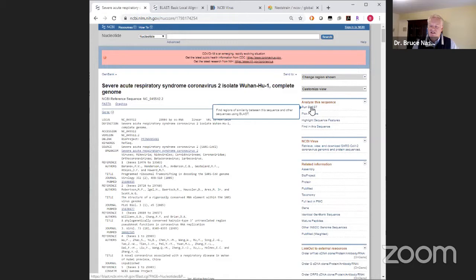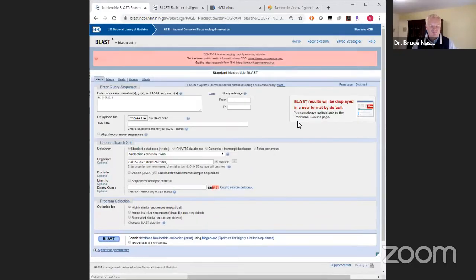And I'm going to run this program called BLAST, which uses the nucleotide sequence to look for other nucleotide sequences that are related to it. Okay, and the search tool gives bonuses for things that match well. Things that are identical are the best. Things that look kind of the same are a little worse, as you might expect. Okay. So I'm going to run this program called BLAST.